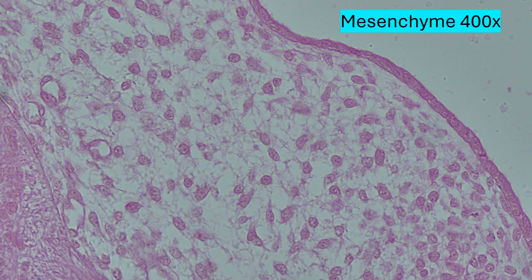Now we're zoomed into an area containing mesenchyme, which is derived from the mesoderm. It is the link to most all components of connective tissues as well as other organs and tissues. So it's a great example of what links this very diverse group together. Here we have a bunch of unspecialized cells that have potential to differentiate into many different typical cells in adult connective tissues. You can see some extracellular parts that are a bit more string-like.